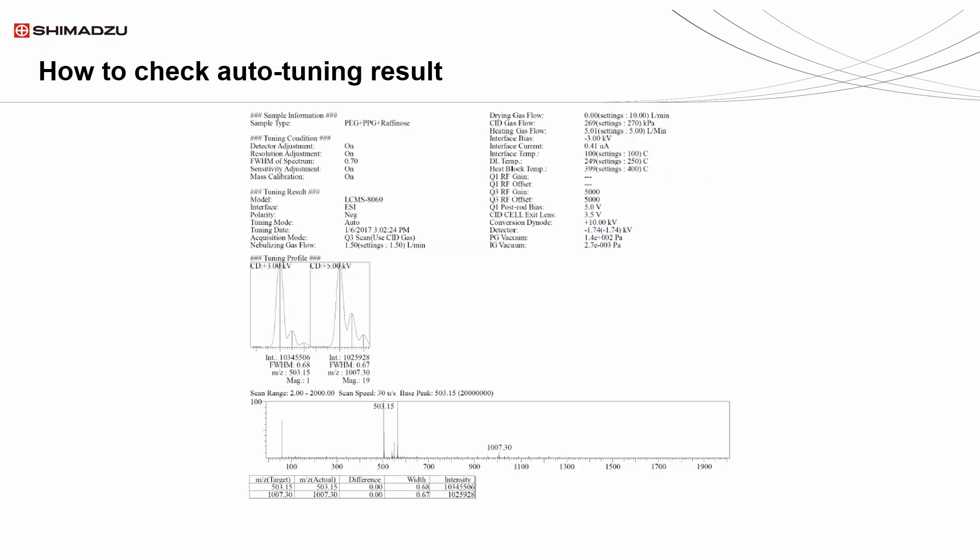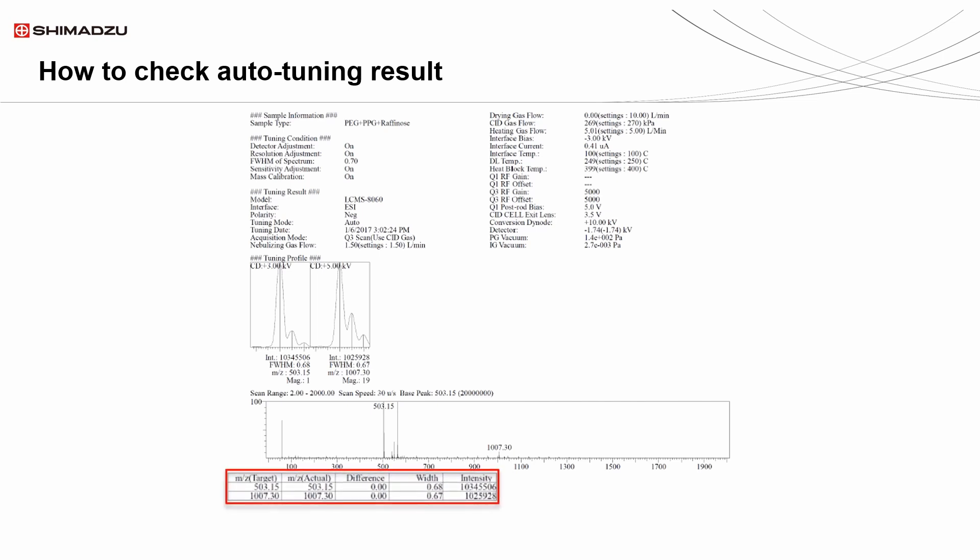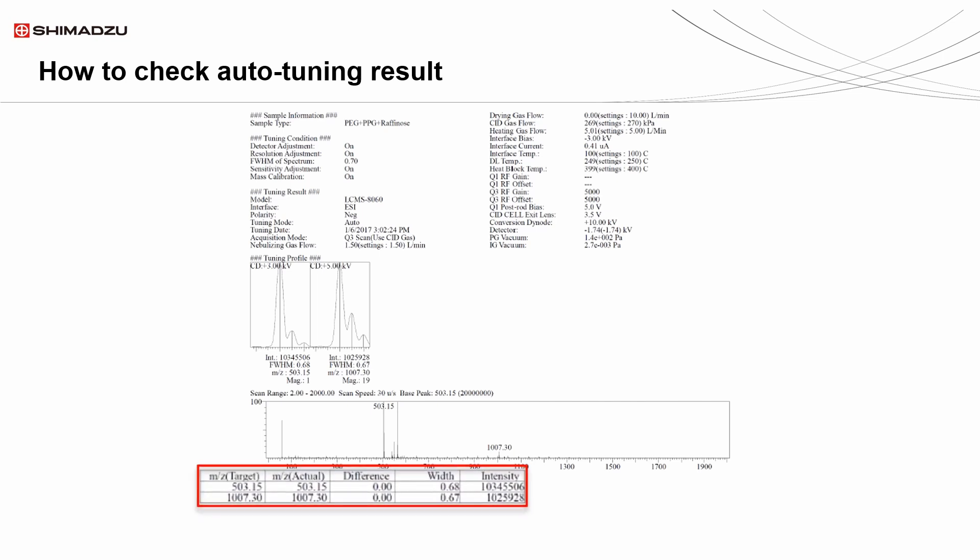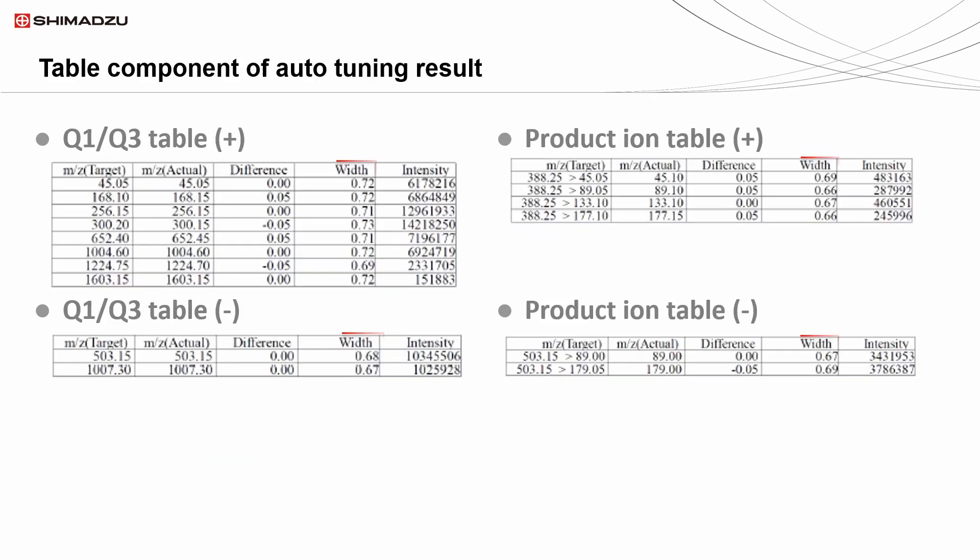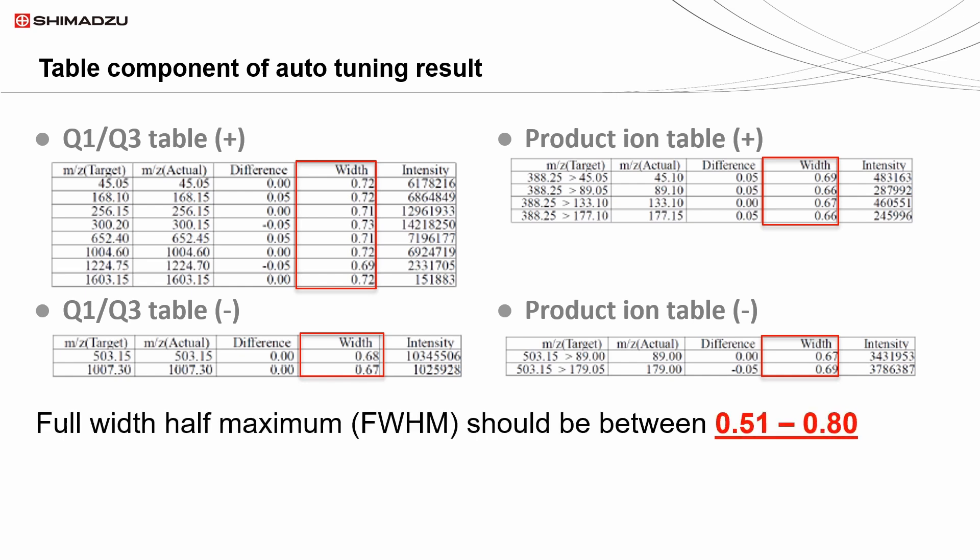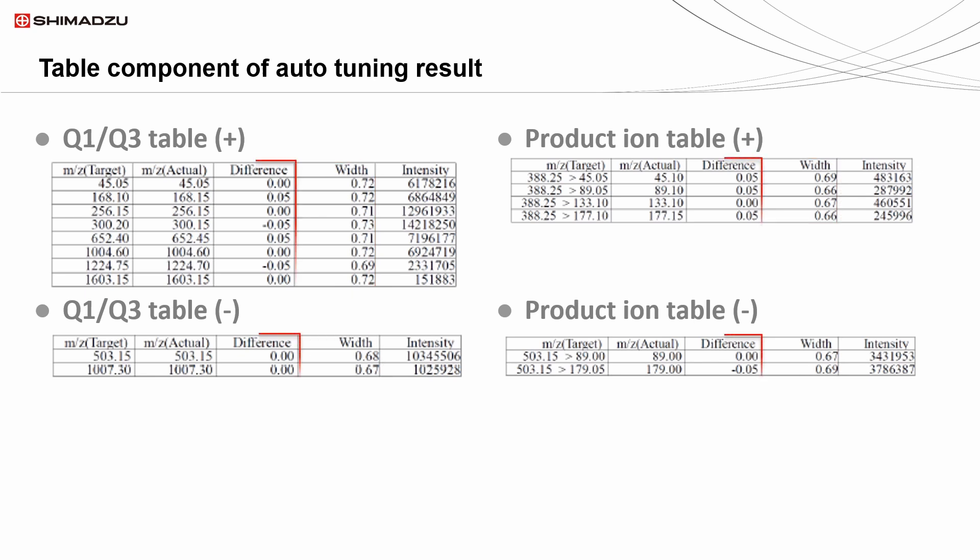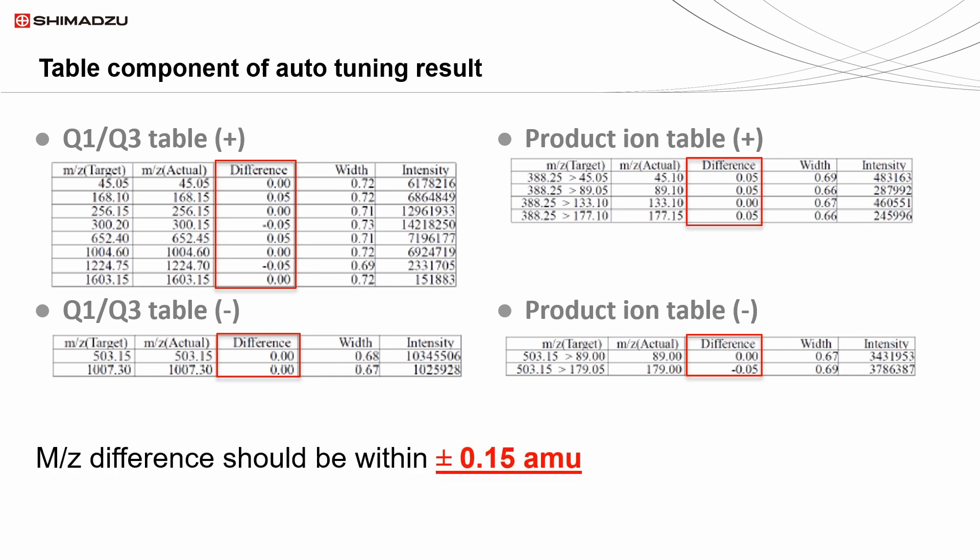Next look at the summary table of the tuning result. In the table, the values in width column are full width half maximum of the compounds. These values should be between 0.51 to 0.8. Then, the column on its left shows the difference between theoretical M over Z and measured M over Z. Values in this column should not exceed plus minus 0.15.